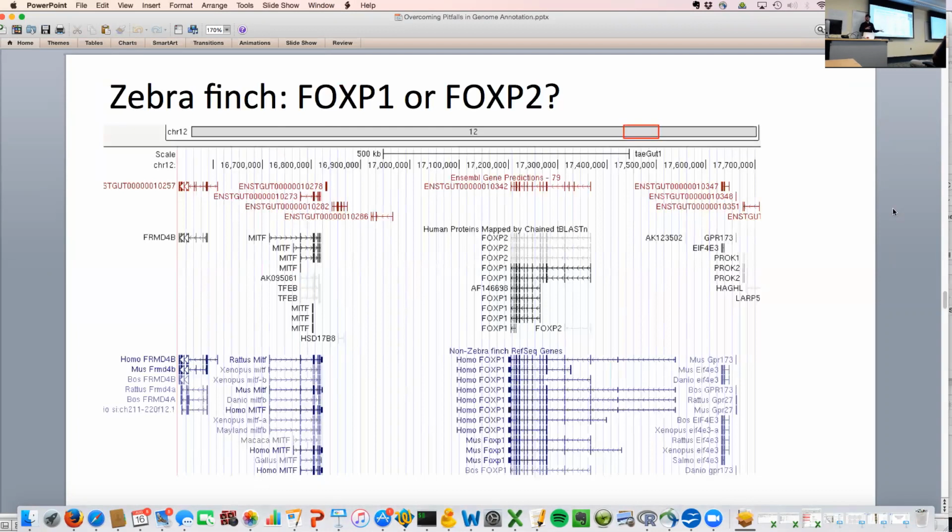Yeah, I guess I'm speaking less practically about how, because there's so much more time, you're going to have things that have broken. This local gene order has been broken. And so you also want to be looking at chicken and zebrafinch generally, and budgerigar too, to try to figure out what's the local gene order in a more closely related species, where you're going to have much fewer of these crossing over, breakpoint, duplication issues to worry about.